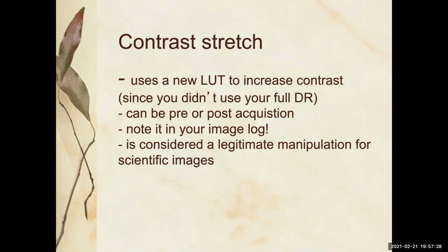Oh, technically you can do this pre-acquisition too. If for some reason you're in some great hurry and you can't figure out the proper exposure, I can't make this brighter, or for other reasons that might come up, you can do this while you're at the scope using the software that you're using to acquire the image too. Either way, note it in your image log, say that you did that. However, know that it's a legit manipulation for scientific images.